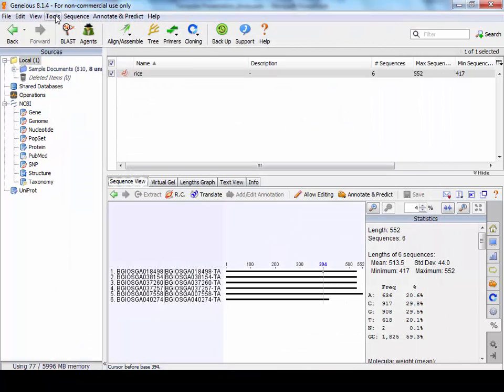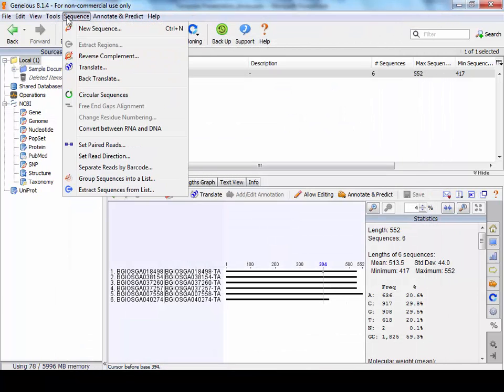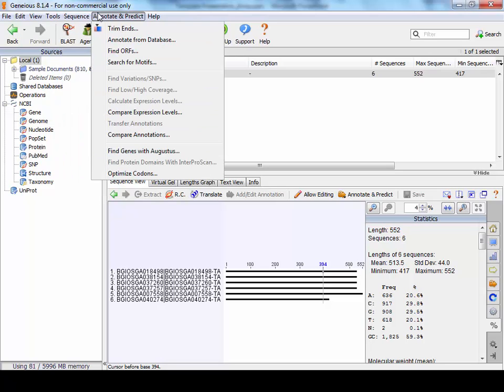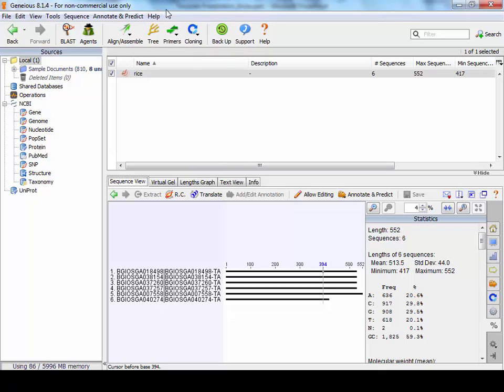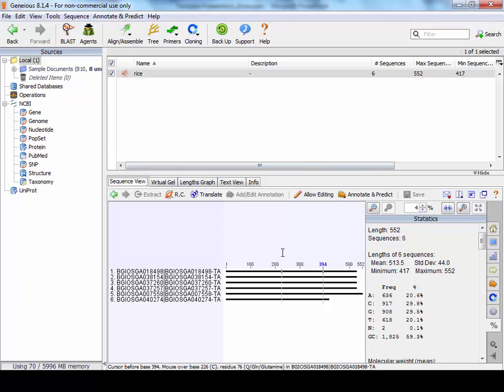OK, so in the sequences section, you can reverse complement, translate, do other things, annotate. Because I've installed the Augustus gene predictor, I could annotate a sequence using Augustus, which is a multi-exon gene predictor. There's a number of other short links here for tools and so forth. So that's basically what Geneious has.